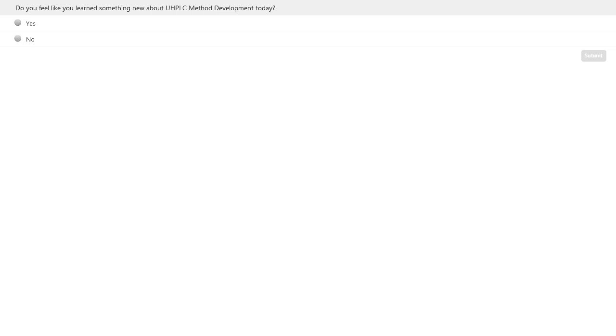The retention time will change when you're translating methods if you change the column volume, so if you're actually changing the column dimensions. And even if you keep the same dimensions and move through systems, you might change the retention time, if that was the question. Okay, one that's a little more straightforward maybe.